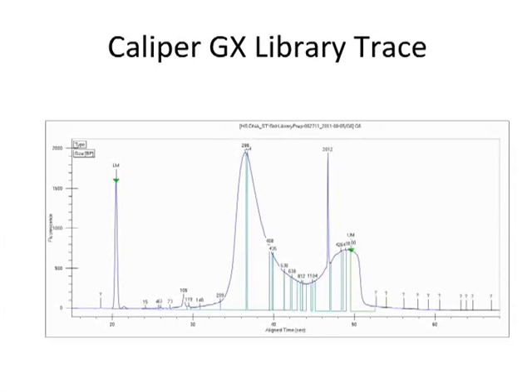The reason the bubble product is so important is if you were to only account for this 295 base pair portion of the peak shown here, you'll under-quantitate or under-represent the amount of your library shown over here, or if you were to use the represented size of this aspect of the peak over here, you'll throw off your molar calculations based on that.